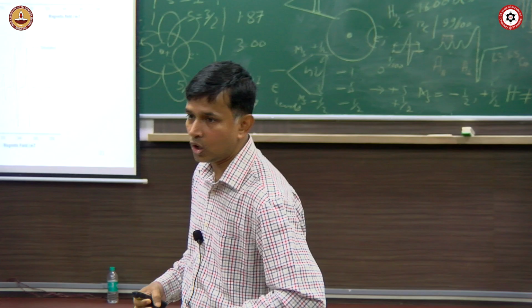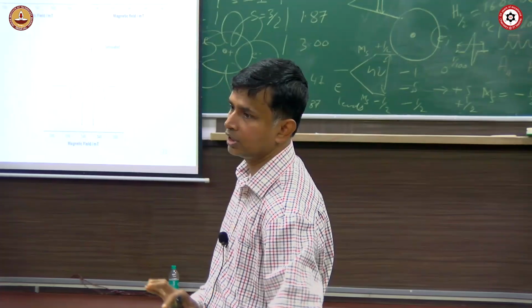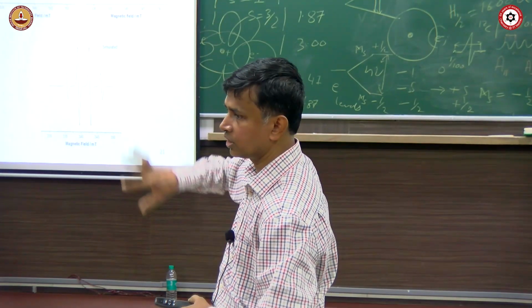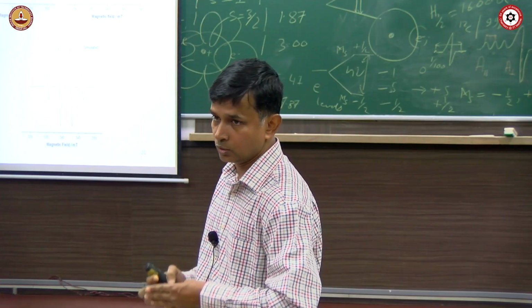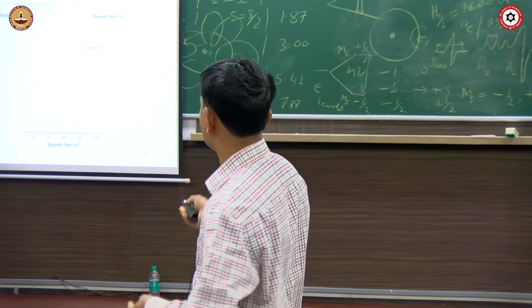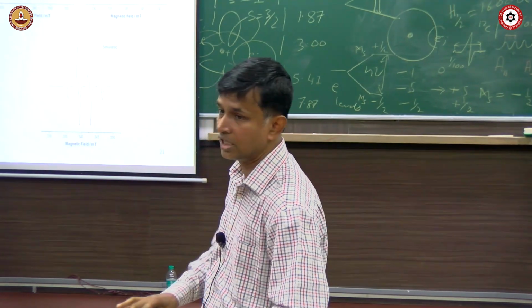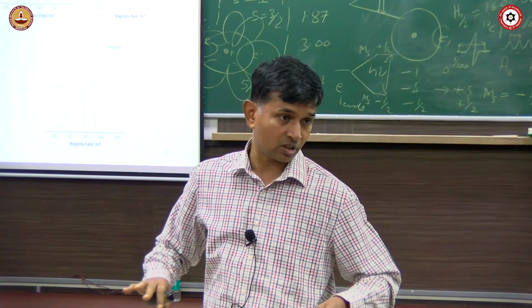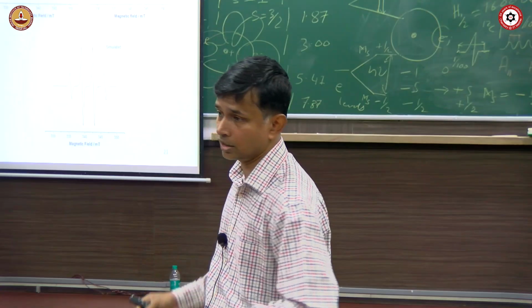Okay, so all kinds of shapes that come from your experiment, you can play with in the software and fit it, and say which is due to the Lorentzian, which is the Gaussian, and how much is the coupling constant. The coupling constant here to here and here to here will all be the same if they are perfectly symmetrical. If they are slightly distorted, this side will be slightly different from this side, a tiny difference will be there.